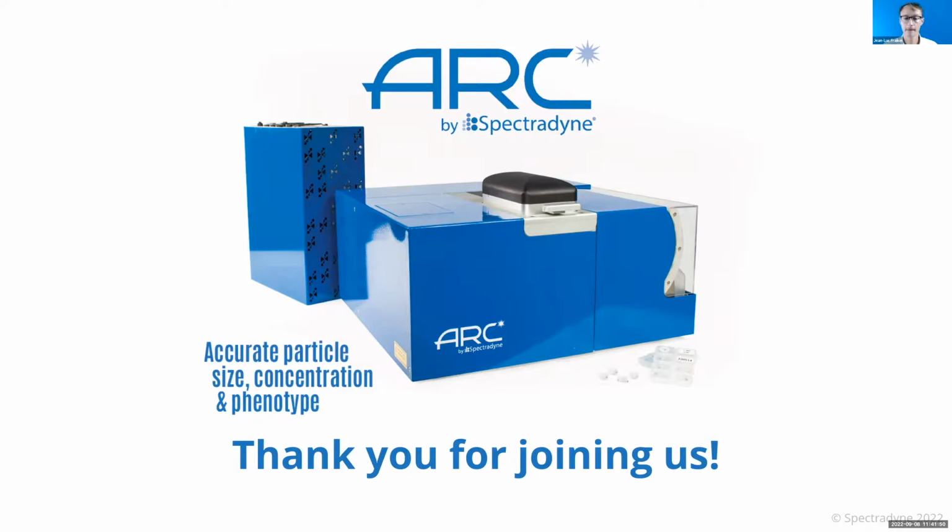Yep, sure. So I see one in the chat. When we're looking at the axis of fluorescence signal against the size axis, can you translate the signal directly into ERF? So can you directly plot the signal on an ERF calibrated scale so that we know how close to the limit of detection the EVs are? The answer is yes.